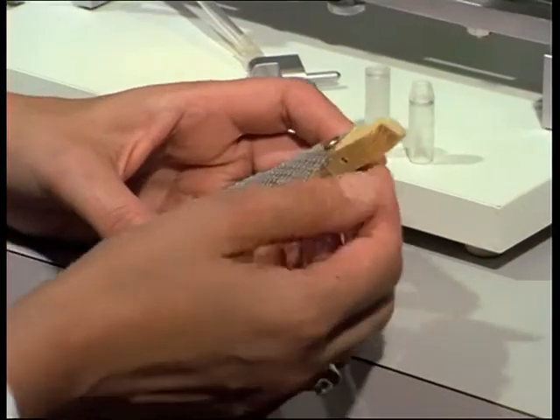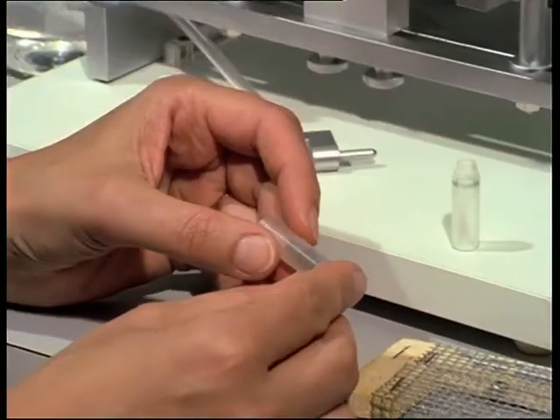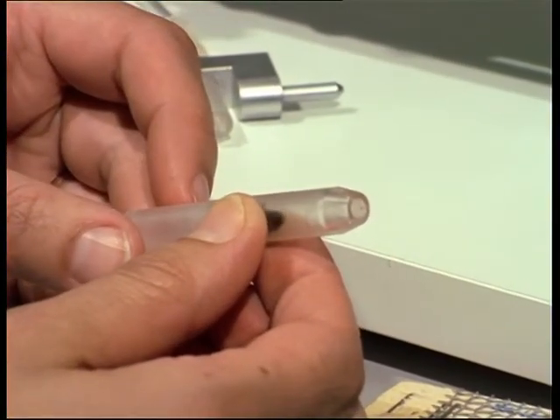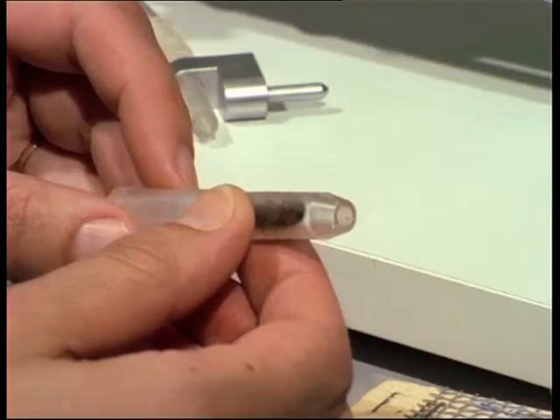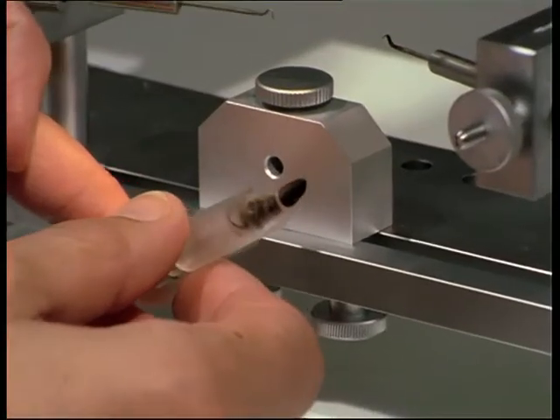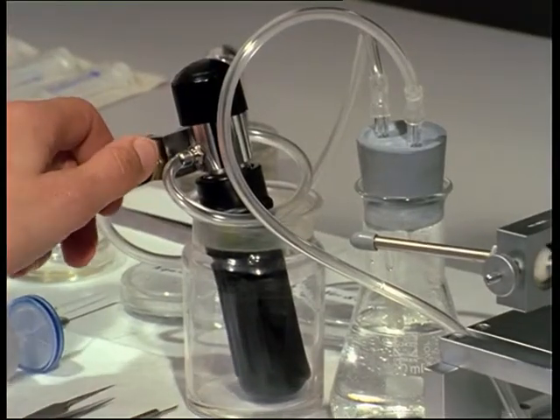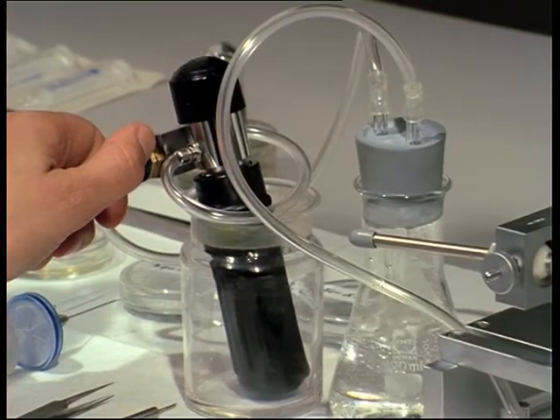A queen, who was treated with CO2 on the previous day, is placed headfirst into the retaining tube. The queen holder is fixed to the block on the instrument. A whiff of CO2 helps to immobilise the queen. To control the dose of gas, it flows through a washing flask.